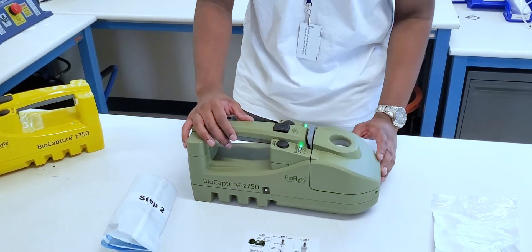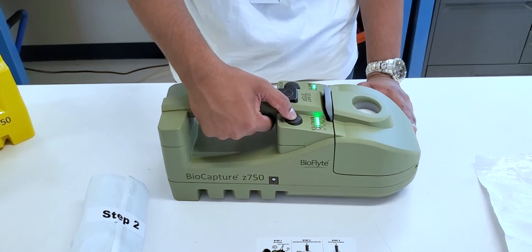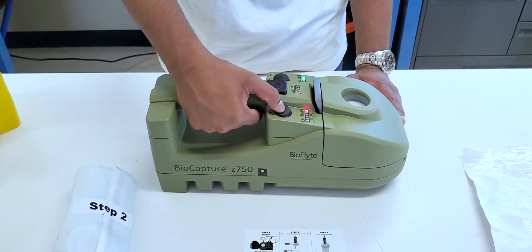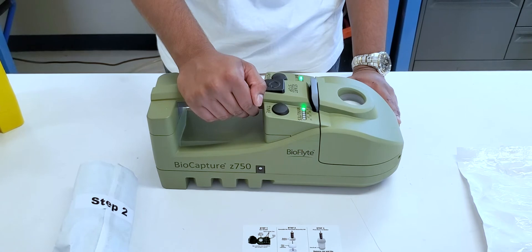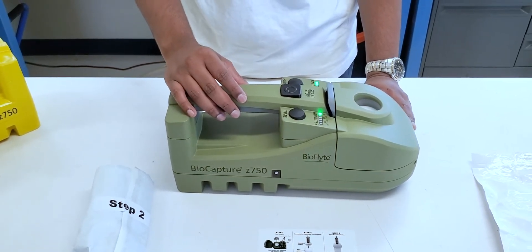After closing the device, we can choose the amount of time for our sample mode. We can toggle anywhere between five to thirty minutes or five minutes on high flow rate. For this example, we'll be using it on five minutes for the standard 200 liter per minute flow rate. And then we'll start our device.